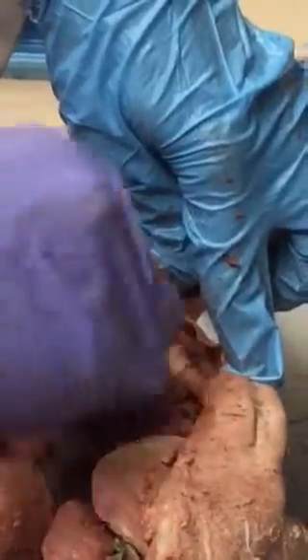Now moving on to our filthy cat, to our urinary system. Got a bunch of coagulated blood in there.